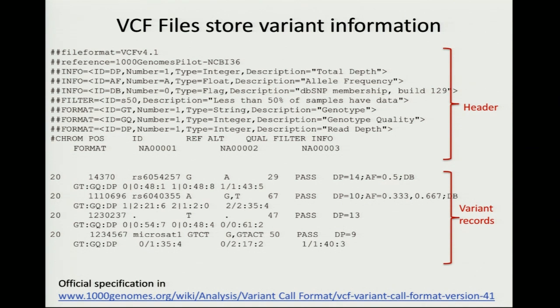Yeah, the nomenclature, why sometimes pipe, why slash, what's different? So you'll find out about that in the tomorrow session. That's called phasing information. Just briefly, what it's saying is that it knows which chromosome these came from, right? Like it knows that this 1 and this 0 go together.